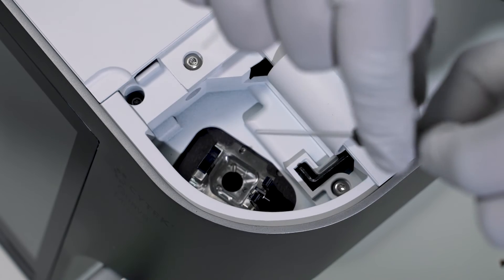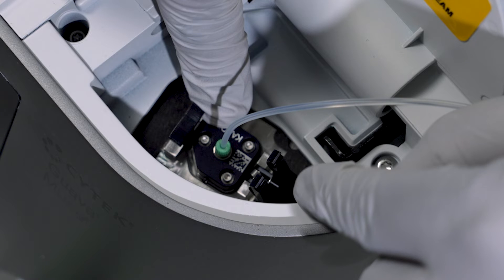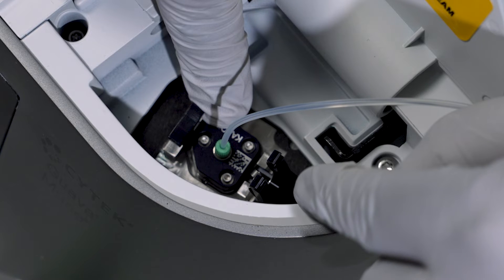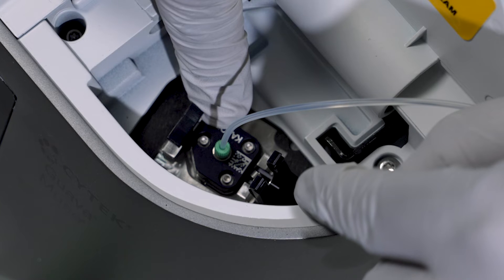Carefully lower the flow cell into the receptacle, aligning the cutouts. If you feel any resistance, the flow cell is not aligned properly in the receptacle and you will need to remove the flow cell and reinsert.